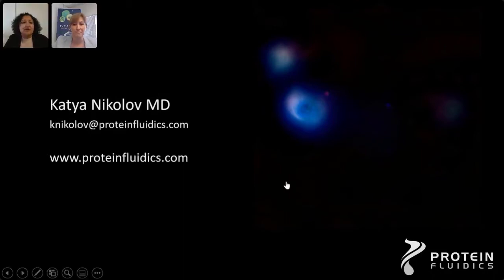Thanks, Katya. One of the questions from Sabrina is, do the organoids have to be preformed prior to plating, or can single cells be plated to allow aggregates to be formed? So at this point, we use organoids or any other models that are pre-cultured and developed somewhere else, and we transfer them inside the Flowchip. We do some work on assessing the possibility of creating them inside with cell lines, but this is ongoing work. As soon as we have new data, we'll share it with you. But as of today, we transfer structures from outside.